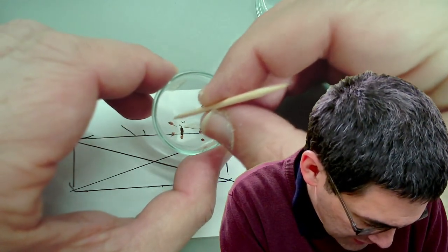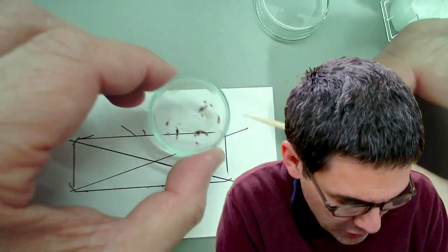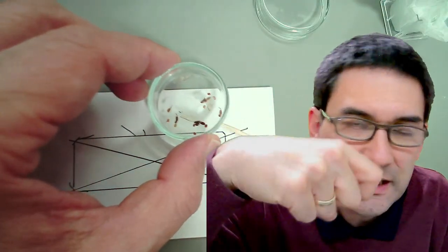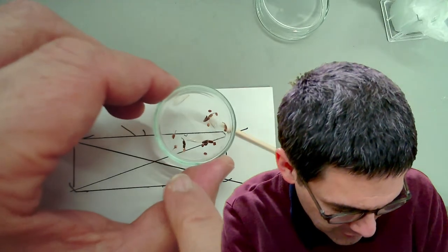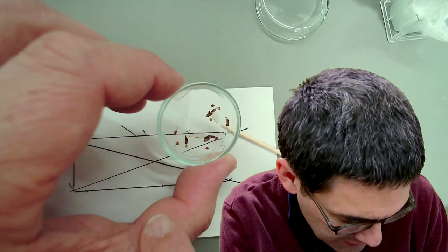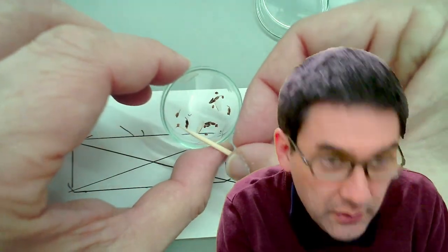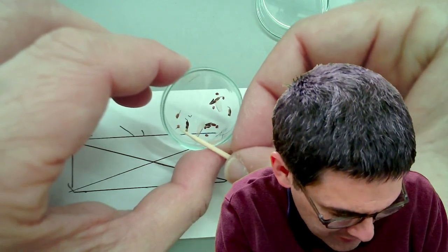No, this one here. But I was a little bit surprised because usually the stingers of bees have a little hook, right? They sting and then they cannot pull it out anymore. But this stinger over here was kind of straight. So this is something that I did not fully understand. I think that's the one over here. So I'm going to mount this and then I'm going to see.